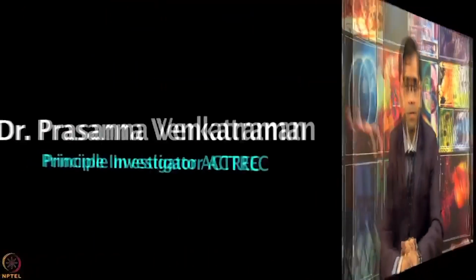In today's lecture, Dr. Prasanna will further explain the surface plasmon resonance SPR technology to know why and when it is applied to study the protein-protein interactions. So, let me welcome Dr. Prasanna for today's lecture.